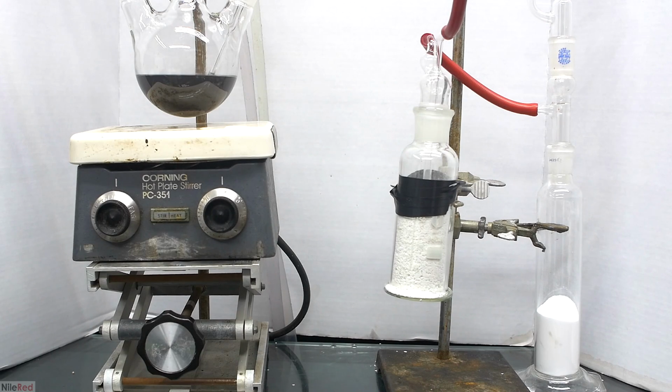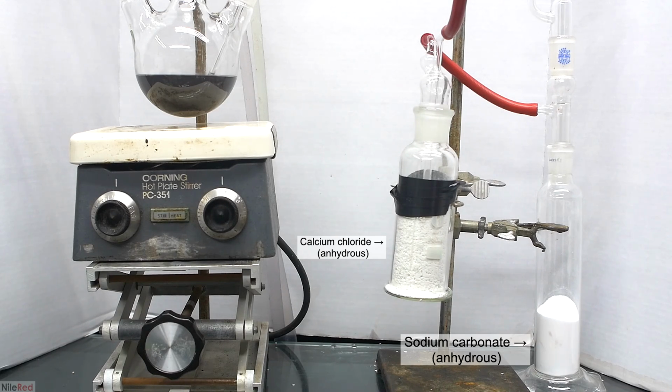This system involved using two gas bubblers, where on the right I have anhydrous sodium carbonate, and in the one on the left I have calcium chloride pellets. The premise here is that I'll drip acid into the sodium carbonate on the right, CO2 will bubble out, go through that little red hose, pass through the calcium chloride pellets, which will dry it, and then this gas will be led into the reaction flask.